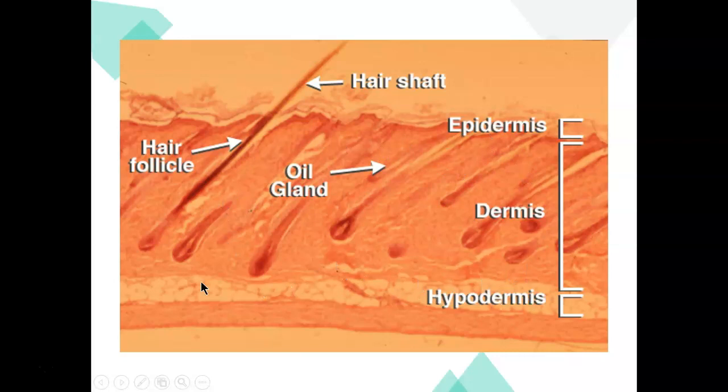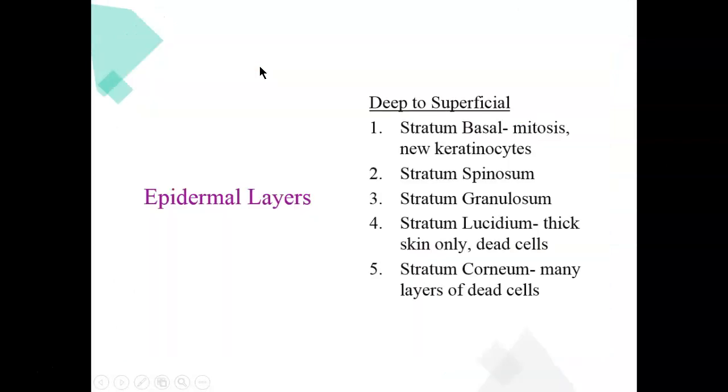Here you have the hypodermis. Hypo means what? Exactly, under. So hypo, under the dermis. This is sometimes called the subcutaneous layer also. Sub, below, cutaneous, skin. So if you get a sub-Q injection, the needle is inserted into the subcutaneous area. And here you can also see the underlying muscle tissue. All right, so just an overview there as we begin looking at these.